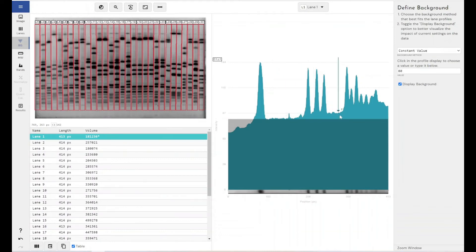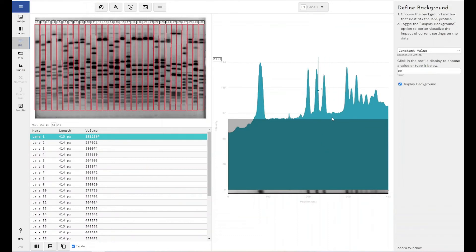So it's a very hard and rigorous approach to removing background. And it would still include all of these measurements here, which again are just darker gray areas, but not signal of interest within our lane. So using a constant fixed value to remove your background is a very arbitrary way of doing it.